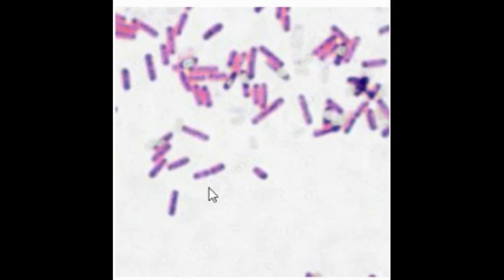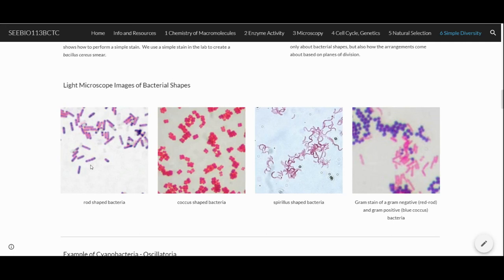So if you have a Bacillus cereus, what's the shape of the bacterium? You should be able to answer that. I'm going to give you a quiz for the questions, but you'll still have to submit your lab notebook for the drawings. But go ahead and submit the quiz for the questions, because that way you can get credit for that. Do these cells grow singly or in chains? That's pretty obvious. What details of cell structures can you make out? I just mentioned that to you, right?